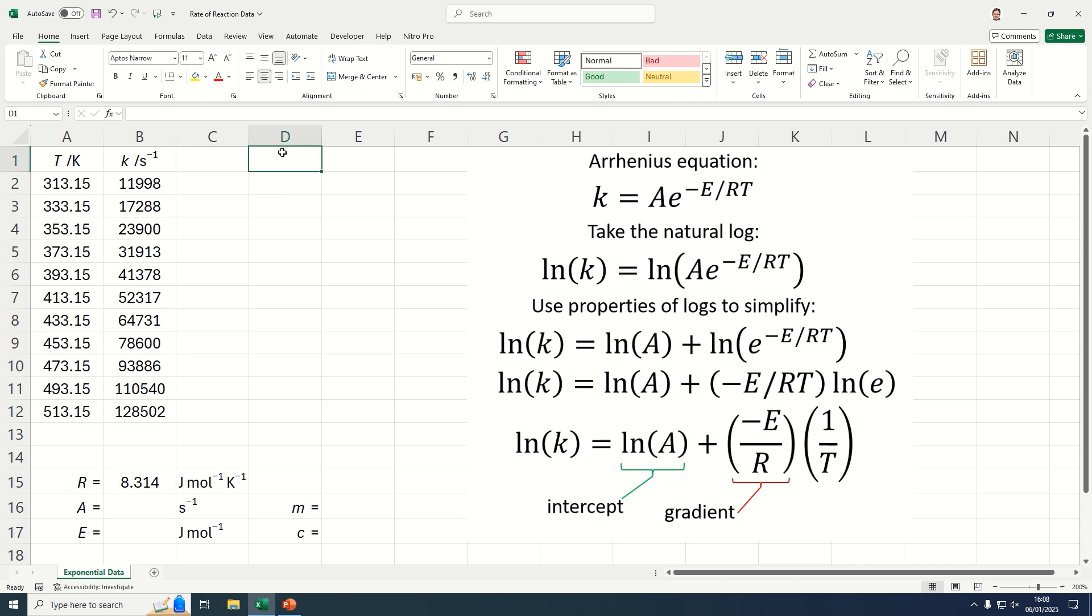So let's set the data up so we can do that. What we're going to do is 1 divided by T here, and then we're going to have natural log of k here.